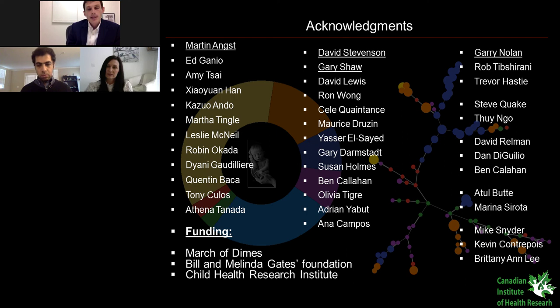Maybe more importantly, in these exploratory studies that we are doing, where the biology is very much novel and hasn't been explored as much in humans as in maybe other diseases like cancer, it's really important for us to generate these initial data sets with a biology that is relevant to what is happening in vivo and is as close to endogenous changes, endogenous functional responses that are actually happening in the human blood.